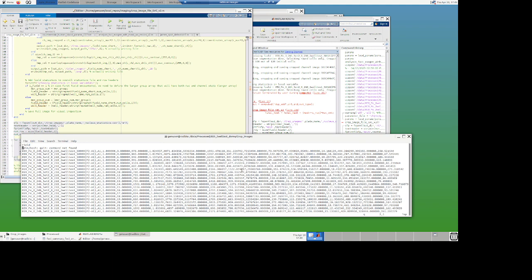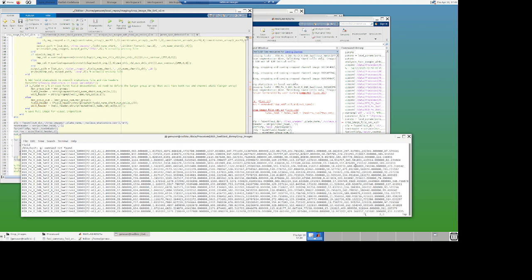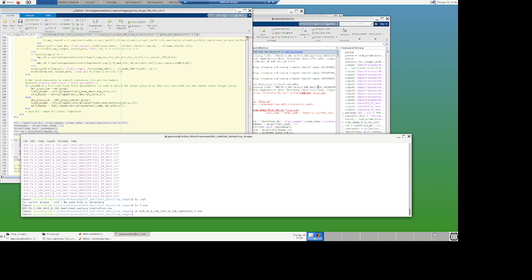I don't know what I'm doing wrong. Shift Q, Q. Why is it not taking this? I don't know what that VI version is. It's annoying. Escape. Okay.